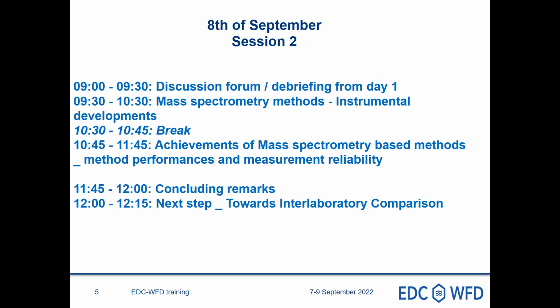So today we will pursue the flow of our method measurement procedure, and we will focus on the mass spectrometry method and all the achievements and lessons we have learned during the instrumental development of our method.